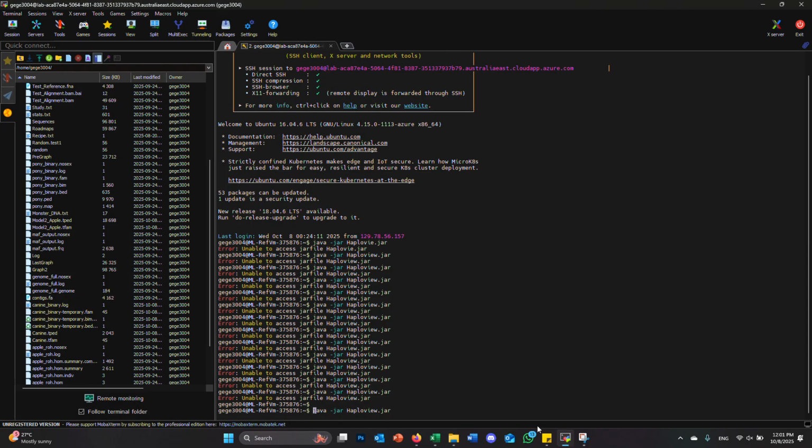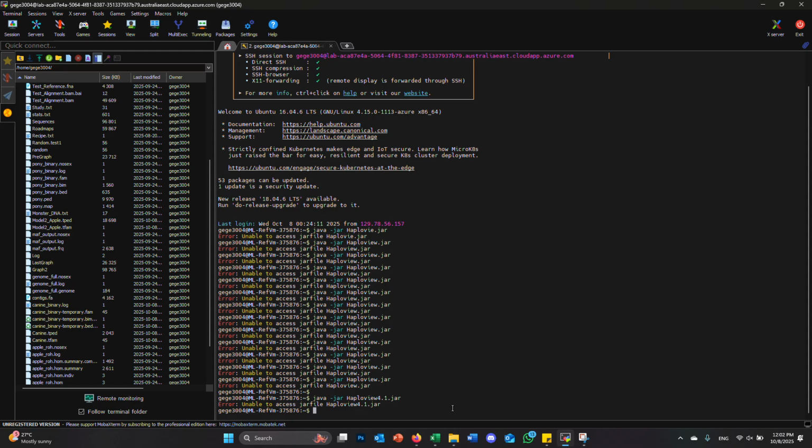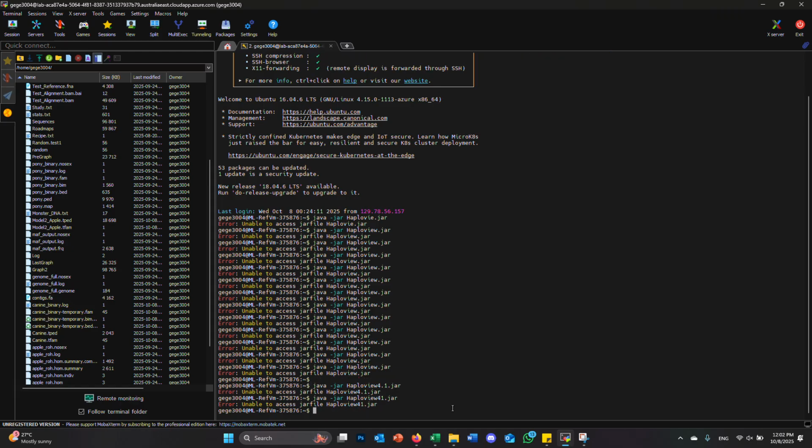Do I need to repeat any of that? Bear with me. So the x-axis is going to be the index; you'll have to scroll to the bottom of the list to get it. Leave the transformation box at default. For the y-axis, select P, and then in the transformation menu, select negative log 10.